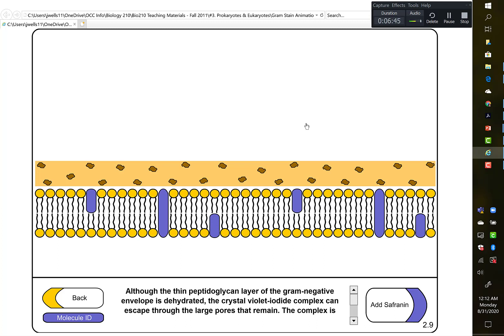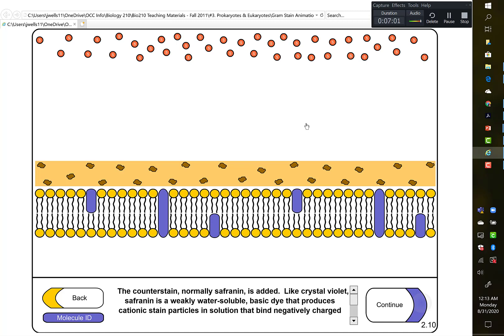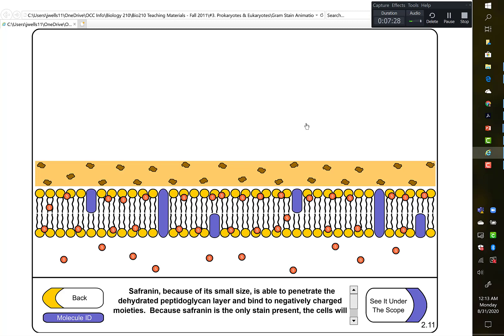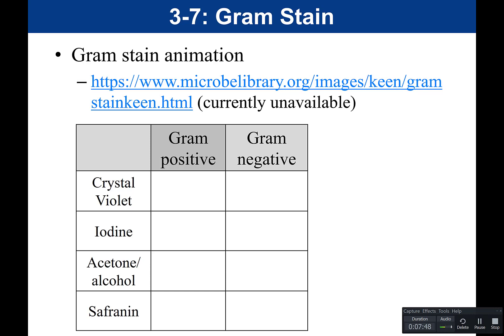Because gram-negative cells are colorless after decolorization, we must add the secondary stain — safranin. Safranin is a basic stain that enters the gram-negative cell, giving it a reddish-pink appearance. So gram-negative cells appear pink-red at the end because they lost their crystal violet and instead took up the safranin.